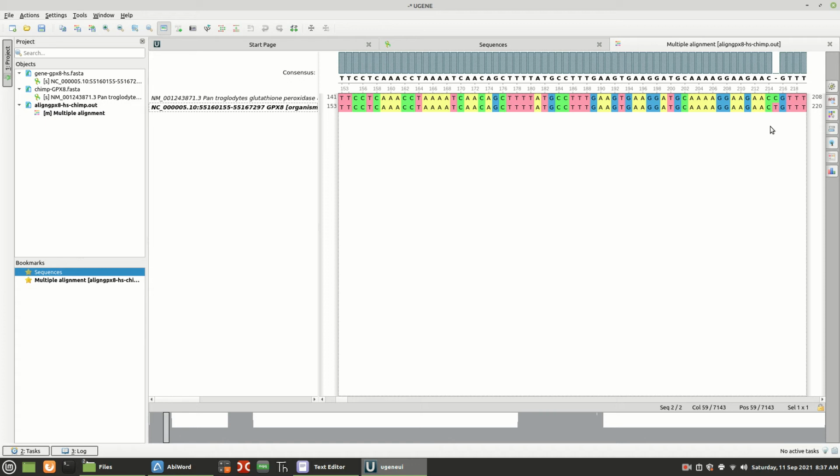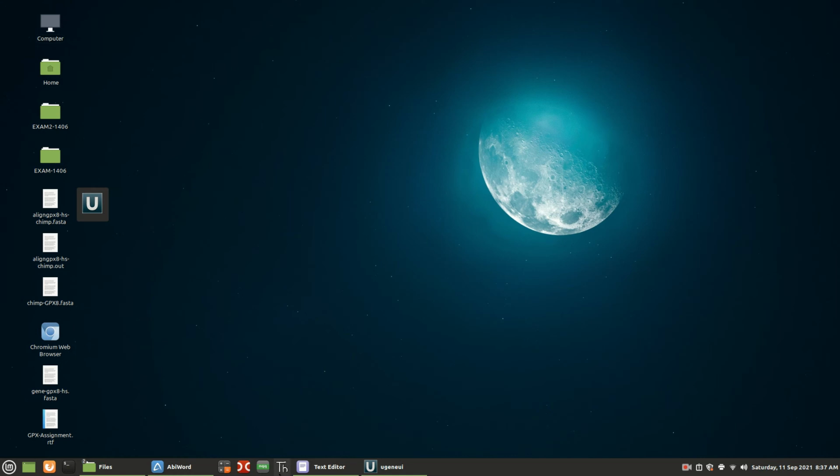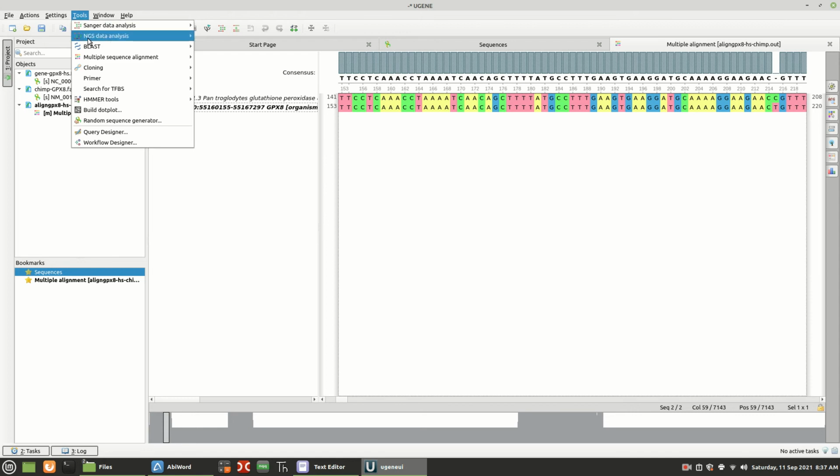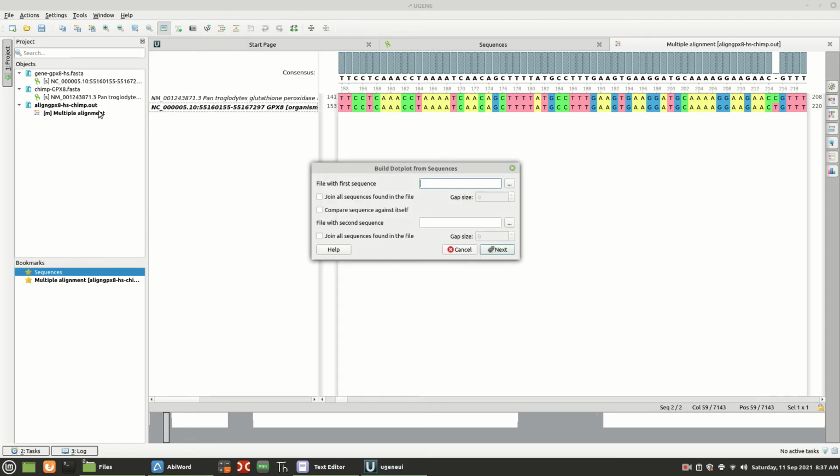And look, essentially this is what the dot plot is, this is zooming in, whereas the dot plot is the bigger picture. And that's what I want you to see. I'm not as interested in you doing this one as much as I am you doing the dot plot and getting some general information about the organism. So I want you to copy the picture, as in let's go back and do that. So let's go back to our build dot plot.